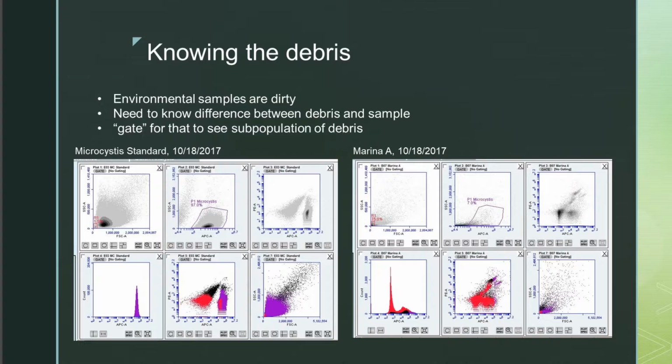So what you essentially have to do is look here in the very, very front corner of your sample. This is my standard again, and this teeny tiny dot that's circled in red is debris. I know that because when I add these up together in the computer program, it tells me that this is, let's look exactly.